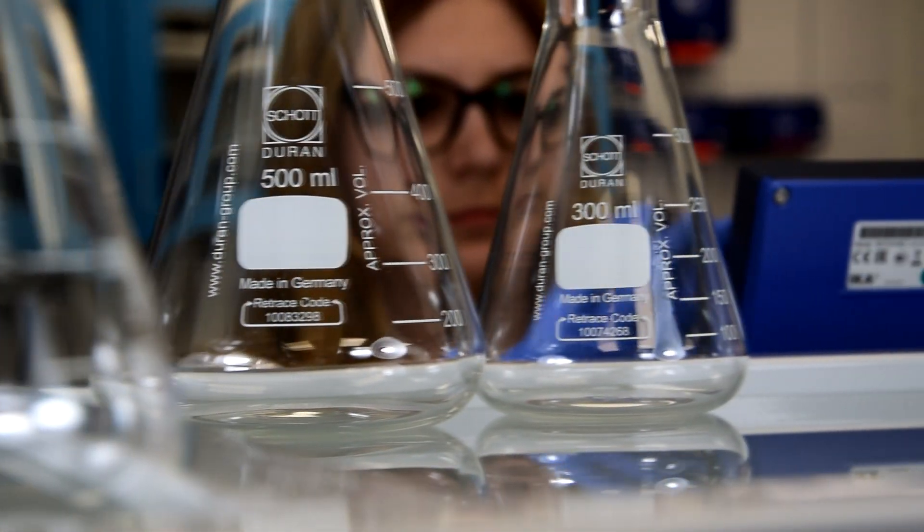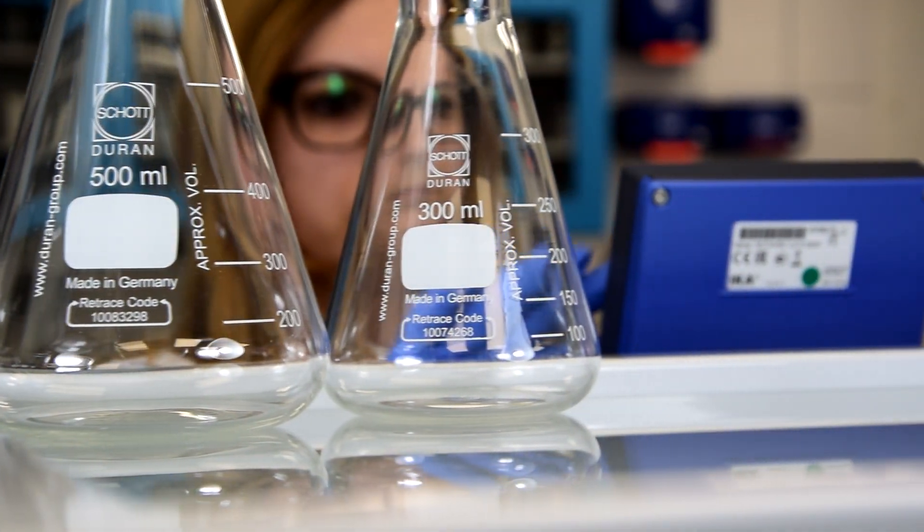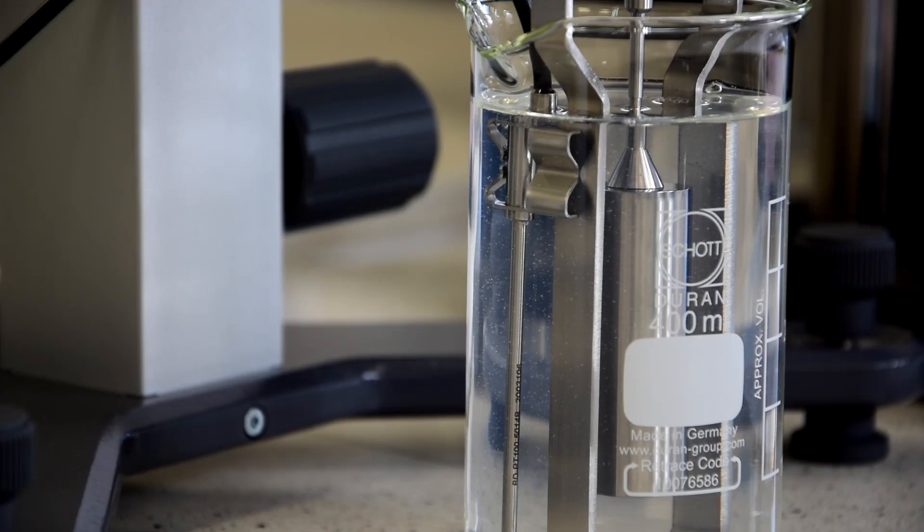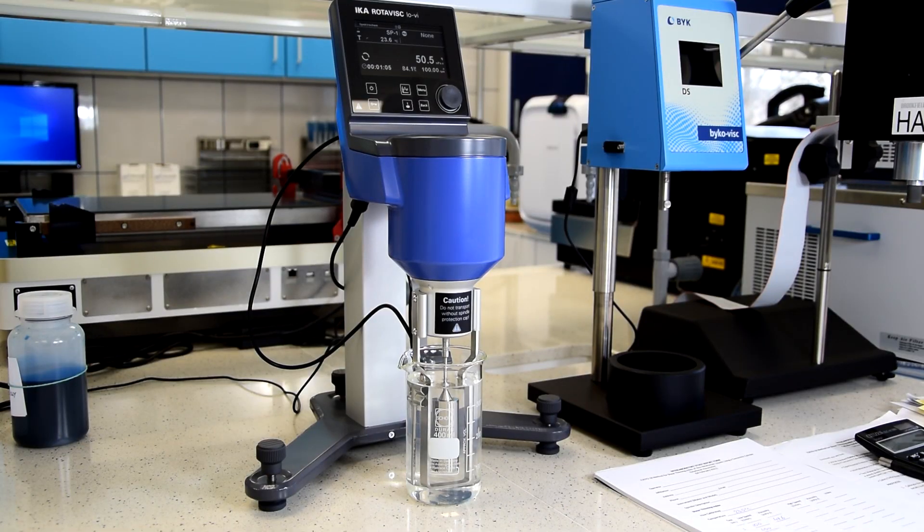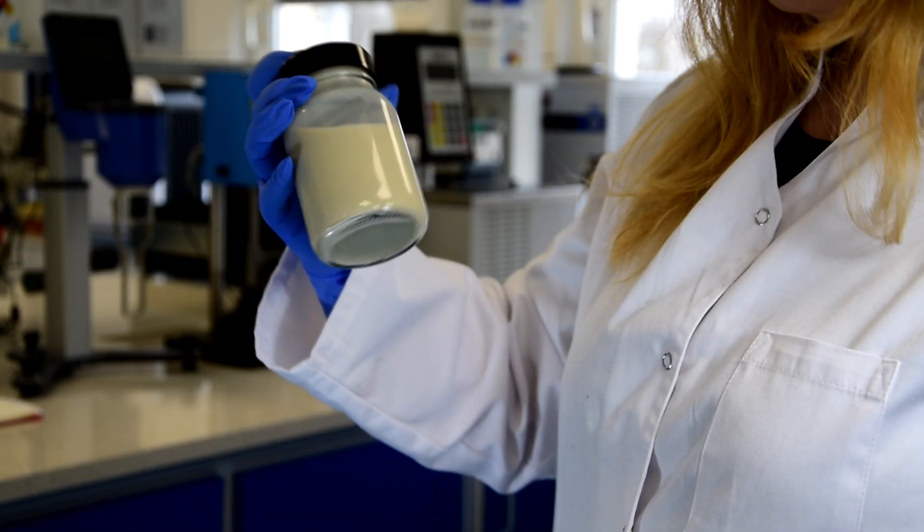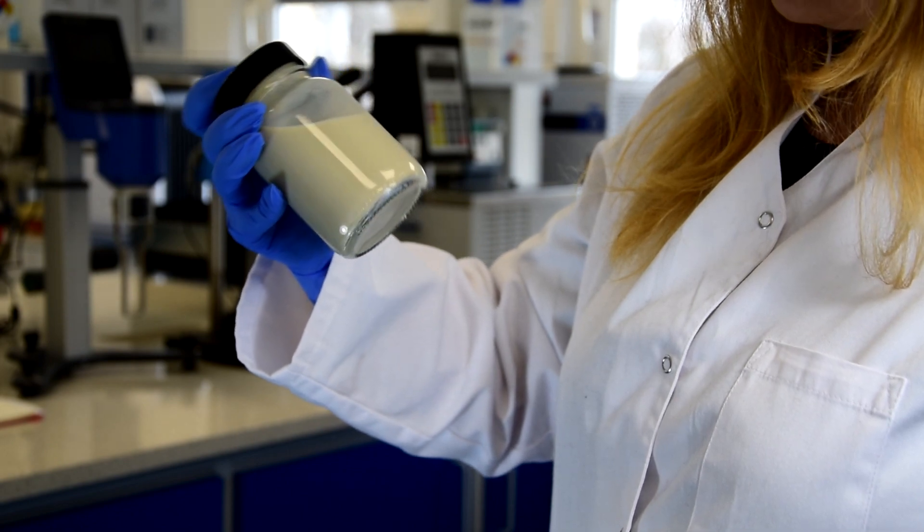Our research includes comprehensive preparation of starter formulations, testing of paints and coatings, as well as solution and suspension of rheological additives, all to achieve proper stability of the formulation.